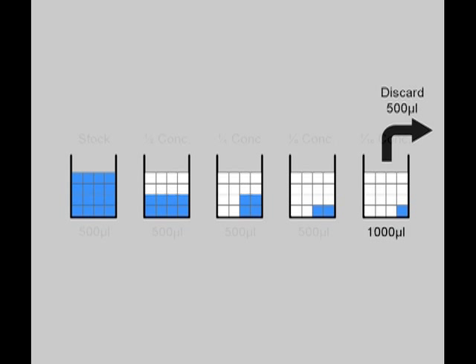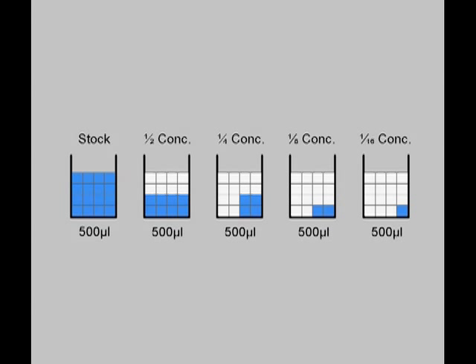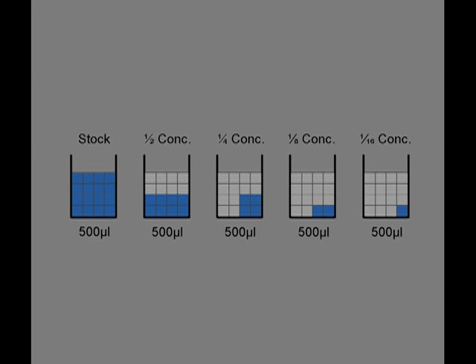Finally, 500μL of the 1 in 16 solution is discarded to give the same final volumes across the entire series. The serial dilution is now complete, and an accurate dilution range has been produced.